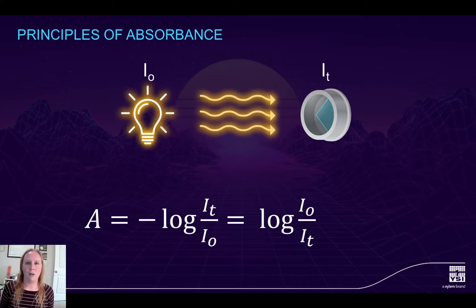So first we're going to do a quick little recap on the principles of absorbance. This is going to be a really brief review because a lot of you are probably well aware of these equations, but they're pretty important, so just stick tight with me for a second.